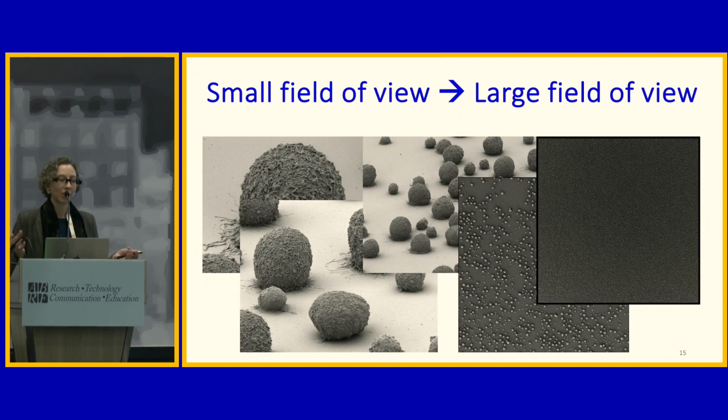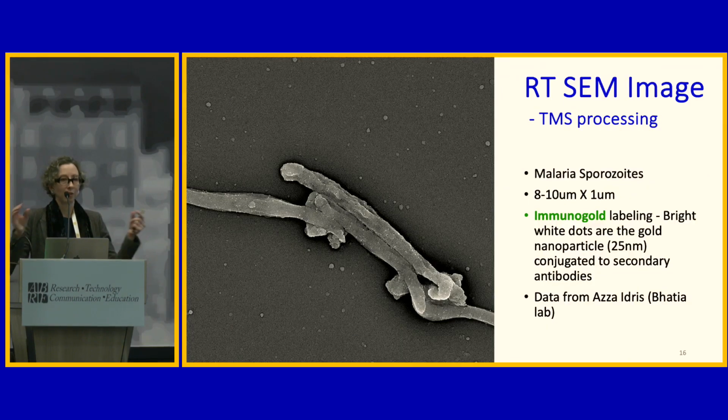And it's important to appreciate that you can generate these images where you're looking at huge fields of view and also maintain really incredible detailed structural information if this is important for the work that you're doing. That said, of course, we have people that want to do the small stuff.